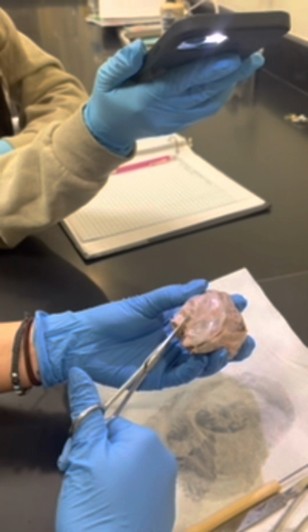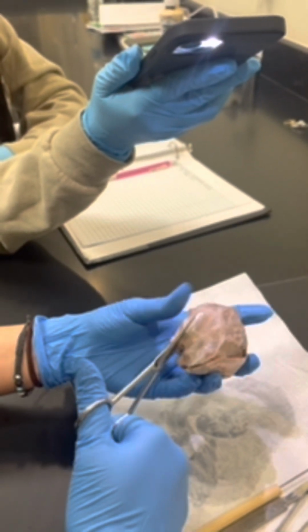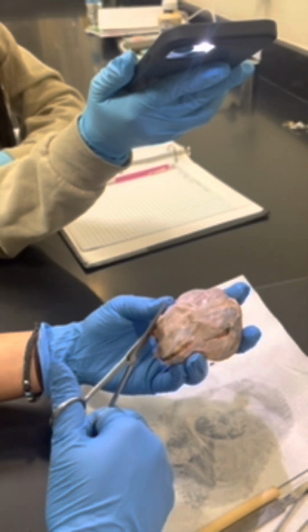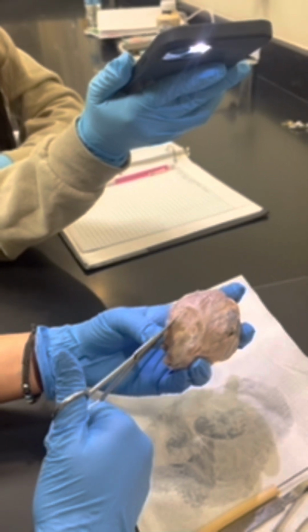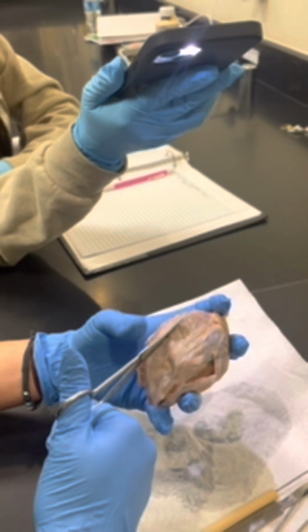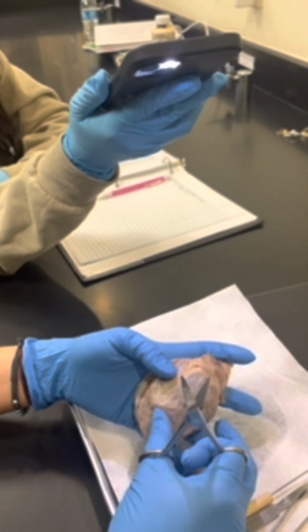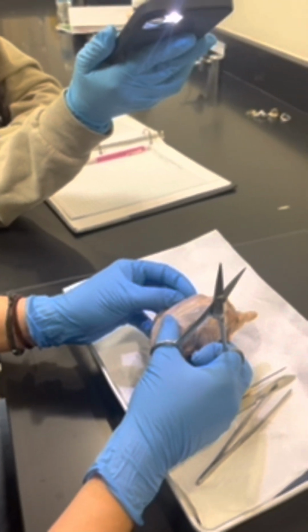I am now going to be cutting through the dura mater from the anterior view down the sagittal section all the way down to the posterior, but stopping before getting to the spinal cord. The meninges are 3 layers of membranes that cover and protect your brain and spinal cord. The outer part, which I am cutting, is the outer layer closest to your skull. Arachnoid matter would be the middle layer, and the pia matter is the inner layer closest to your brain tissue.